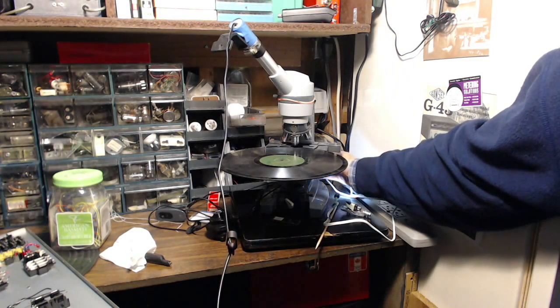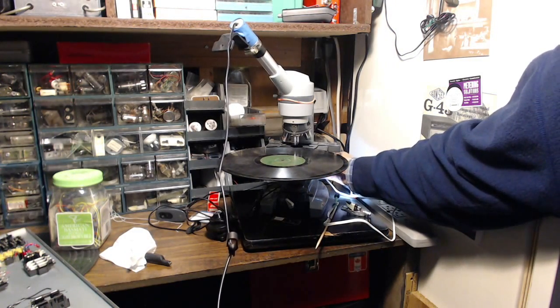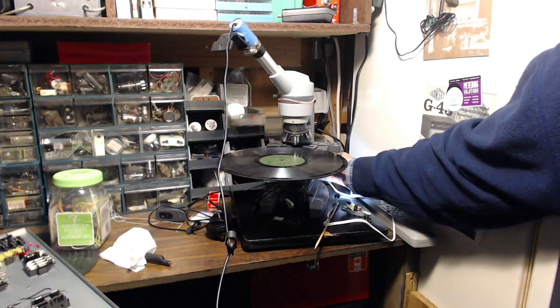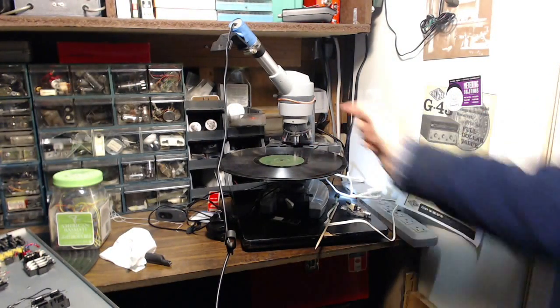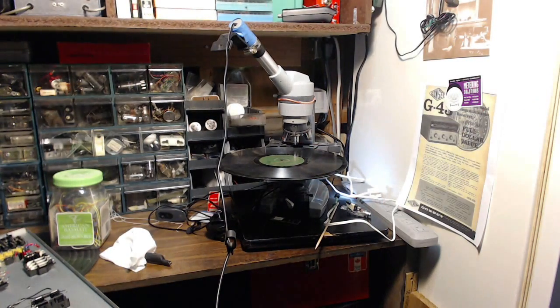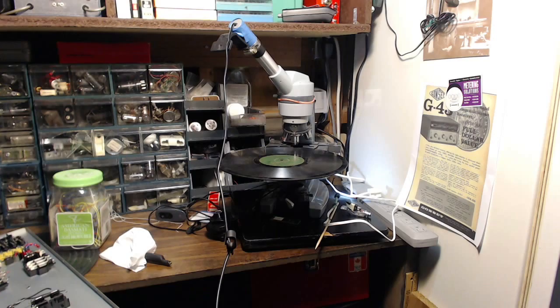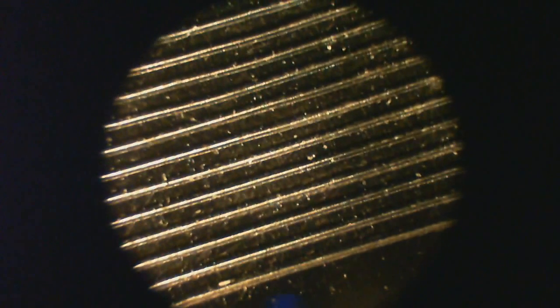And what I've done is I've simply taken a look at the grooves on here. So I'm going to flip over to the camera. There, that's the camera view that's a little more interesting. And what we're looking at is the outside area of the record where right to the edge. Okay that's the edge of the record. Come in and the first groove is right there. So these are the grooves in the 78 record.